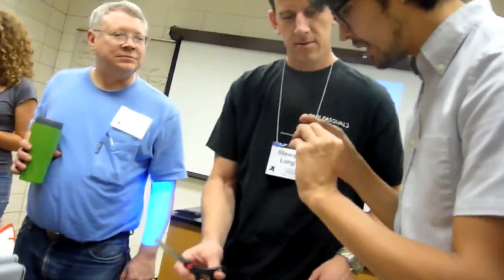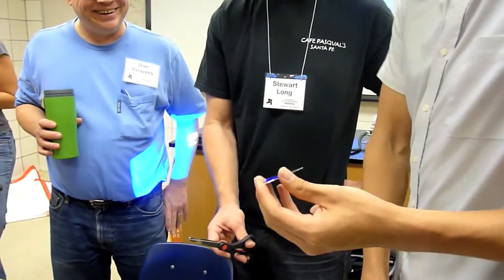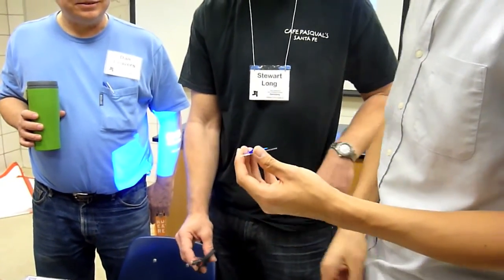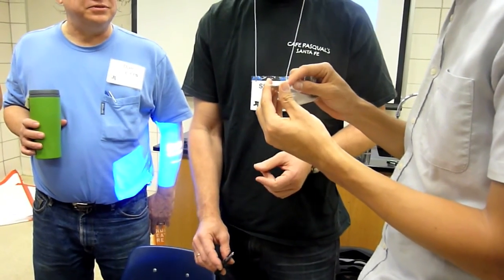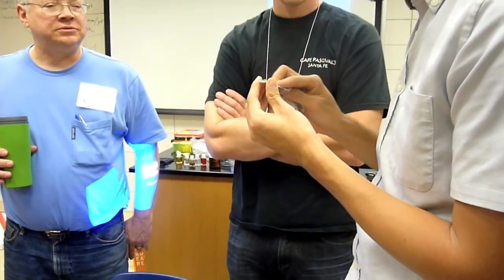Yeah. Also, I never touched the edge, which is not a problem. You can polish it. I have a glasses cloth here. You mean the face or the edge? Well, the face near the edge, because that's what we're going to use.